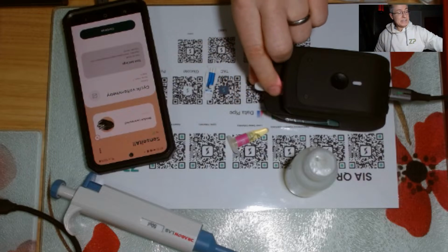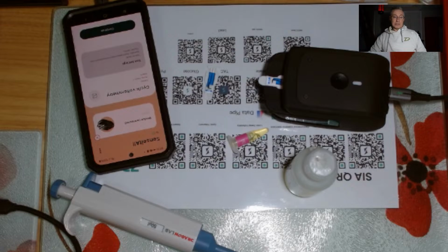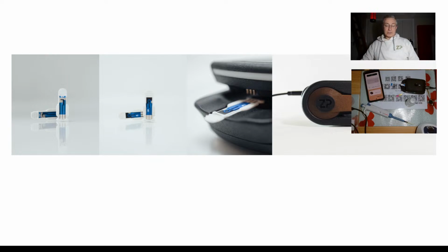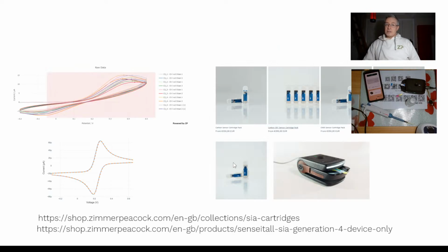So when I see distorted voltammetry the way I've just shown it, it makes me think that somewhere in this circuit there's an impedance problem, especially when this person is able to show me the CVs that they've recorded. So maybe I'll slightly rewind on this.